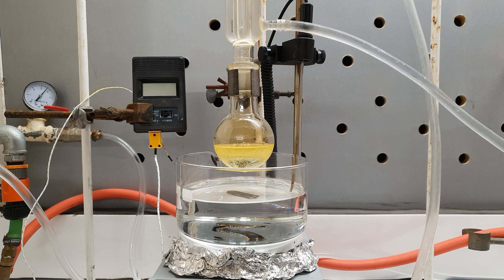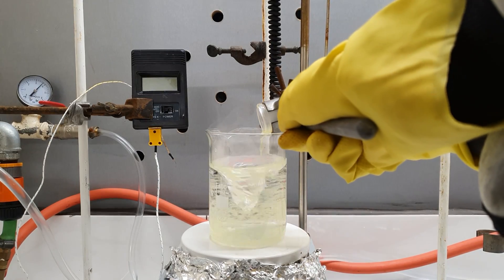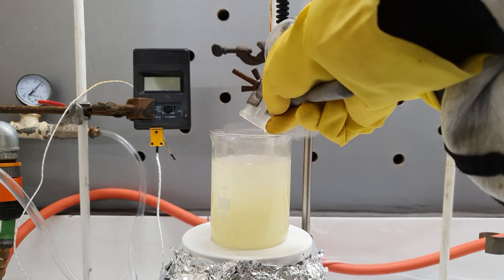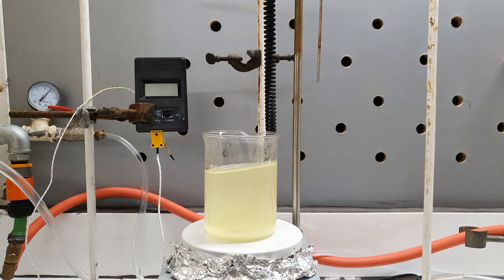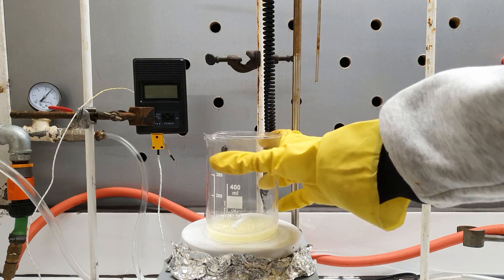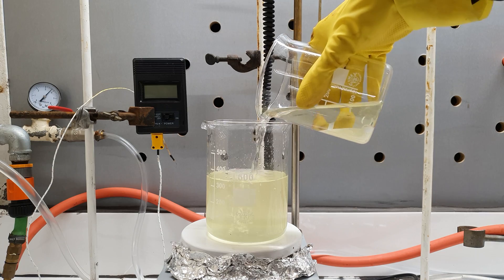The heavier, colorless bottom layer was the acids and the upper yellow layer was our dinitrated product. I separated the layers in a kind of lazy way by just sucking the lower layer with a pipette. Then I poured the organic layer into 300 ml of distilled water. 2,4-Dinitrochlorobenzene is solid at room temperature, so I was kind of disappointed when nothing precipitated out. Instead, an unstable emulsion formed, which immediately separated when I stopped stirring. This gave us a unique opportunity to wash the product from any remaining acid, so I decanted the water and replaced it with a fresh dose of about 150 ml. This washing operation was repeated one more time.